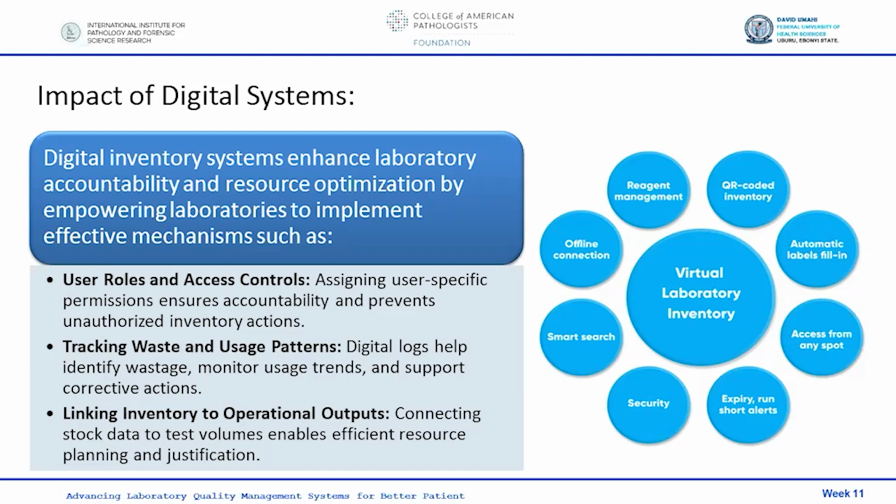It can link inventory to operational outputs, thereby connecting stock data to test volumes. Okay, you know the number of tests you do in the lab every week, every month. Using a digital inventory system, you can connect these two, the stock data, the quantity of stock you have, to the usage volumes, and this enables efficient resource planning and justification.